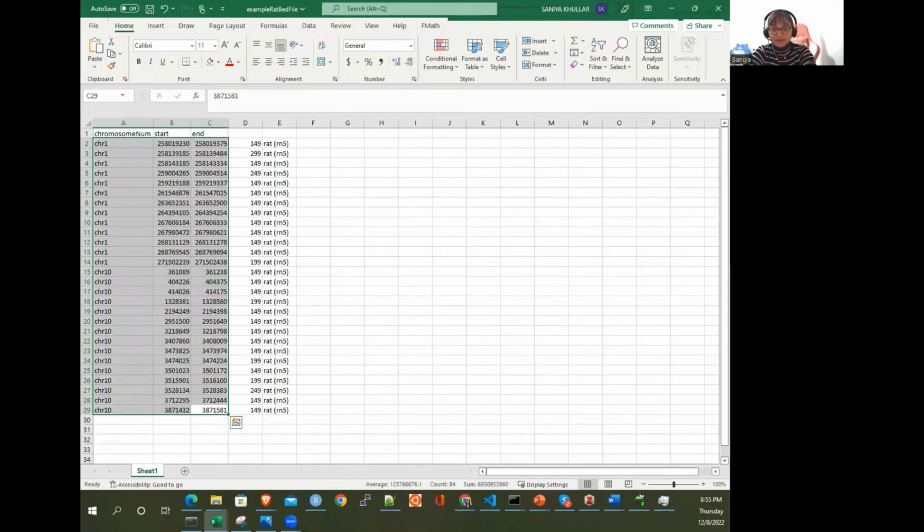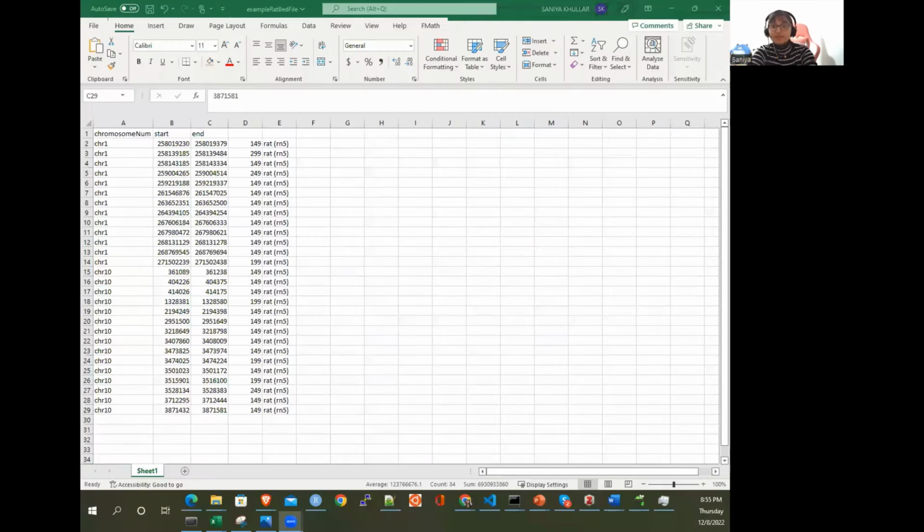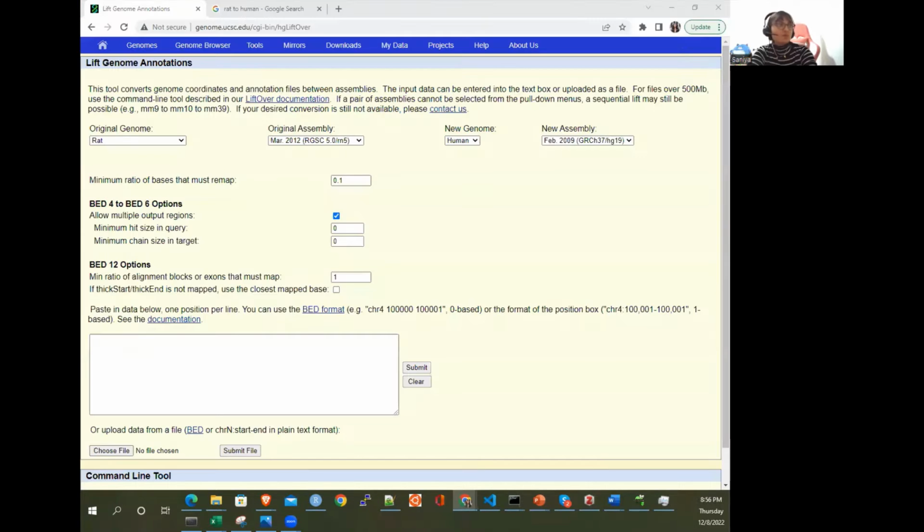So we're going to go back to this tool. And I hope that this can motivate you as to why it is important to do Liftover. It's because we're trying to map these regions that we have identified in rats, or whatever species it is, to humans. And what you'll notice about this Liftover tool, as of the time when I'm making this video, is that it currently is not super accessible to map them to hg38. So we use a bit of a workaround, but I just want to show you so you can be creative when you're looking at this as well.